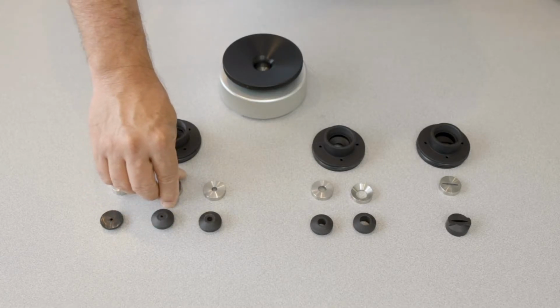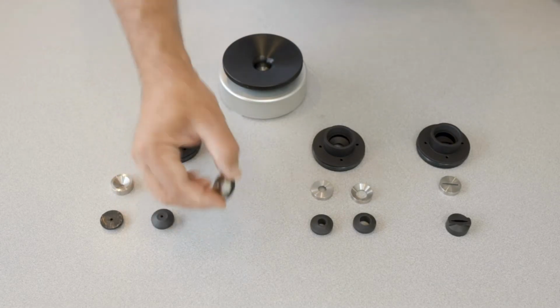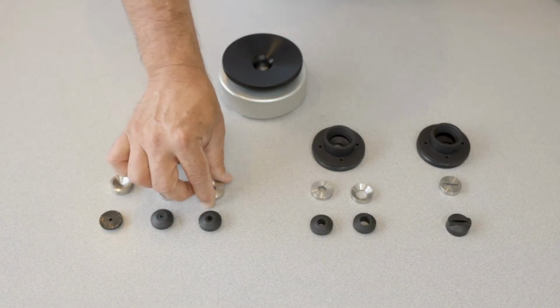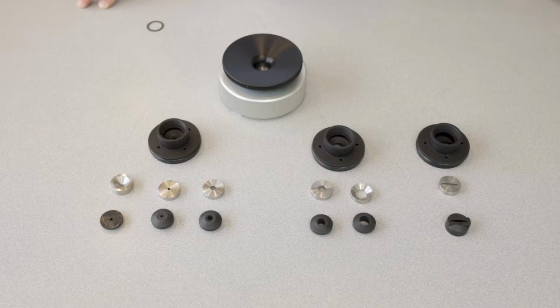The next one would be the one I just demonstrated here, and that's the 1/4 inch sealing system. Again, the insert and the gasket there, those drop down in there. That's a very good system that will fit wine grapes, walnuts, and that type of diameter of petioles.